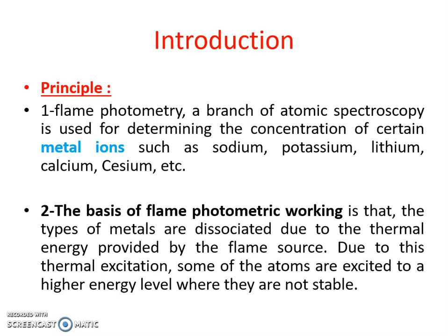Flame photometry, a branch of atomic spectroscopy, is used for determining the concentration of certain metal ions such as sodium, potassium, lithium, calcium, cesium.